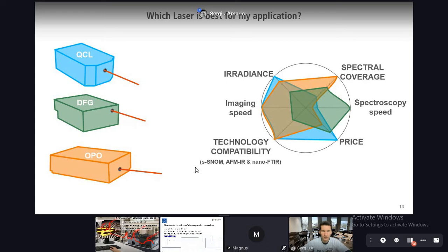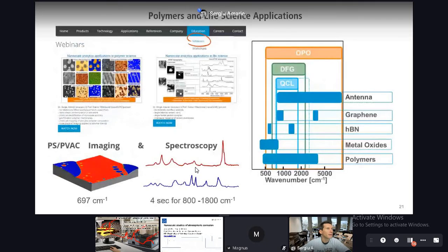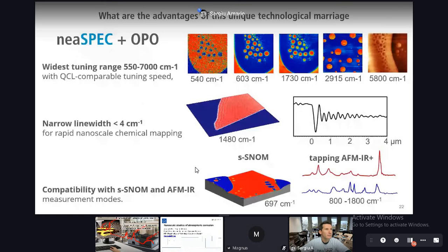So what we refer to is this example here, or maybe the next slide, it's even better. In ASNOM, we use the pseudo-heterodyne detection in order to measure both the phase and the amplitude of the sample. So here is the phase plotted.